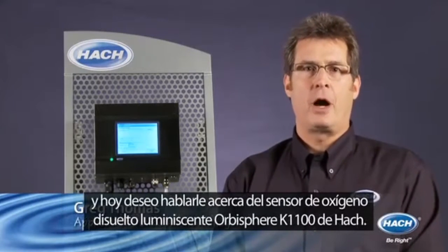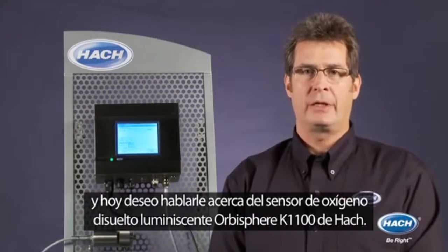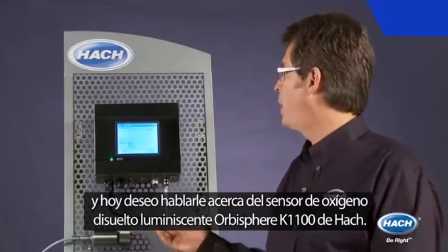Mediequipos presenta. Hi, I'm Greg Thomas, Application Development Manager for Hach Company. Today I'd like to talk to you about the Hach Orbisphere K1100 Luminescent Dissolved Oxygen Sensor.